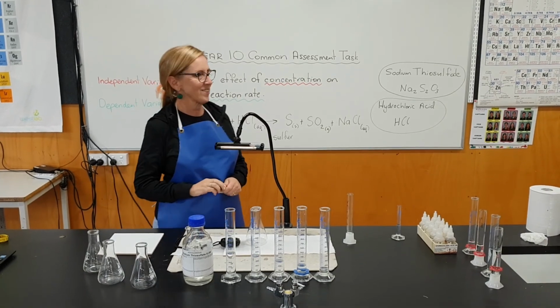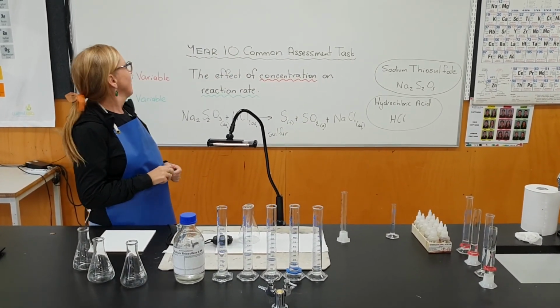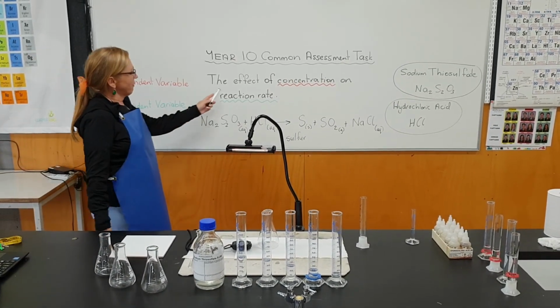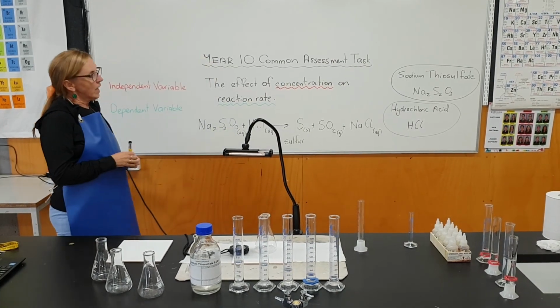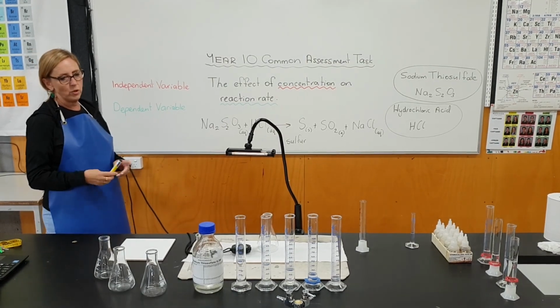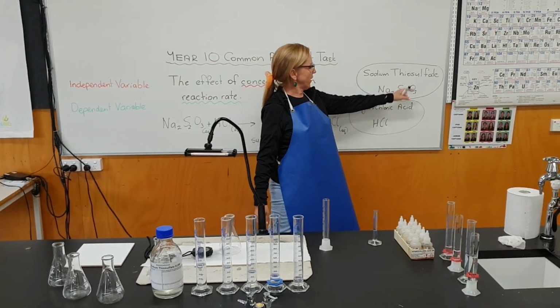Morning Year 10s. What we're going to do today is look at reaction rate. If you just want to look at the board for a moment, we're going to look at the effect of the concentration on reaction rate. And the substance that we're using today is called sodium thiosulfate.